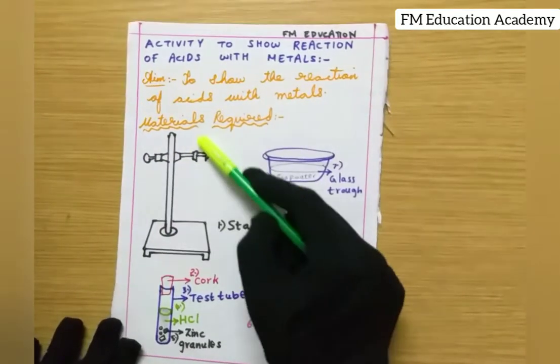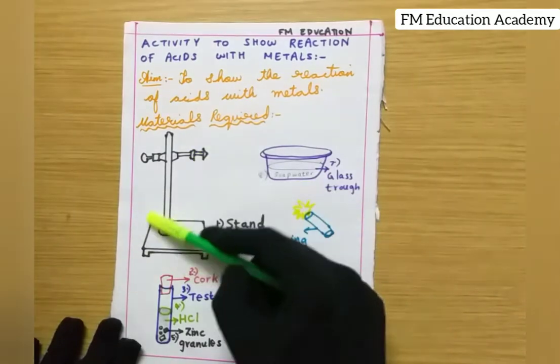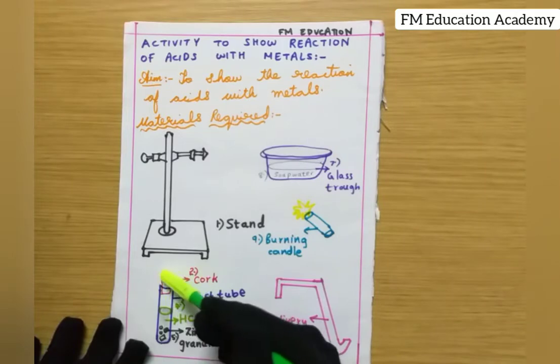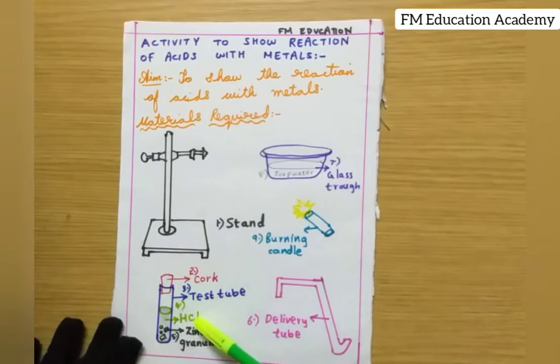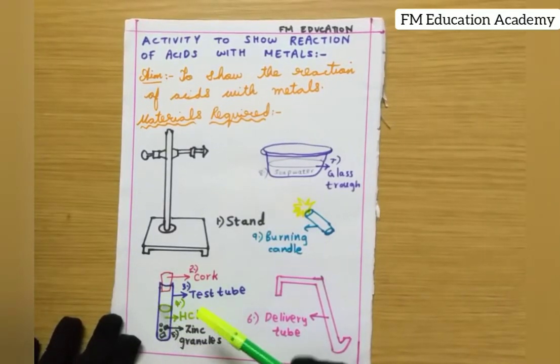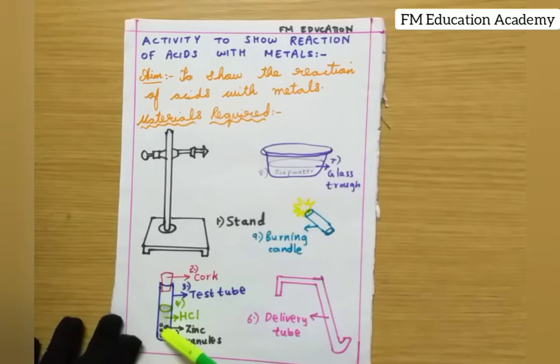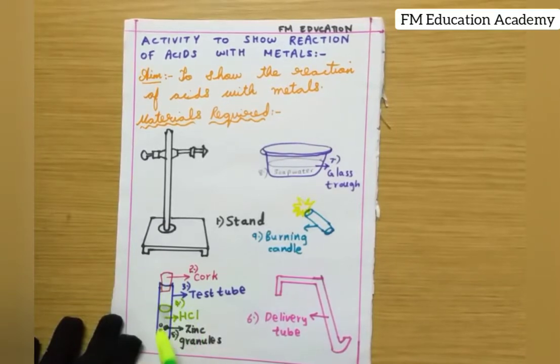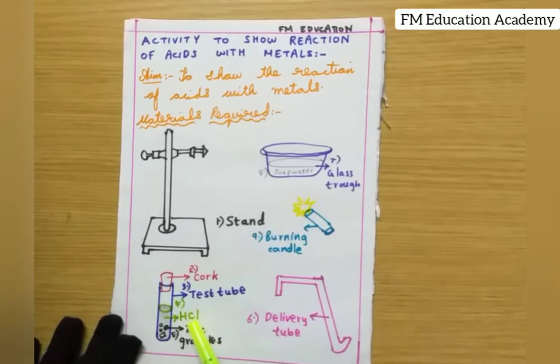The materials required are: a stand with a holder for fixing a test tube, a cork to cap the test tube, the test tube itself, and HCl as our acid. Inside the test tube we will take HCl solution and add zinc granules — zinc pieces — which are our metal. So we are mixing acid and metal inside the test tube.